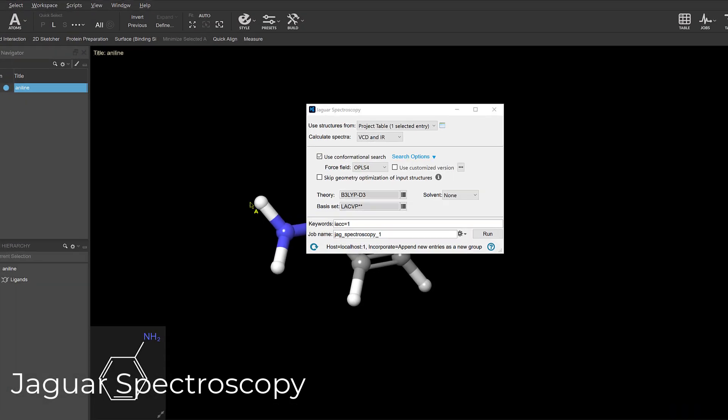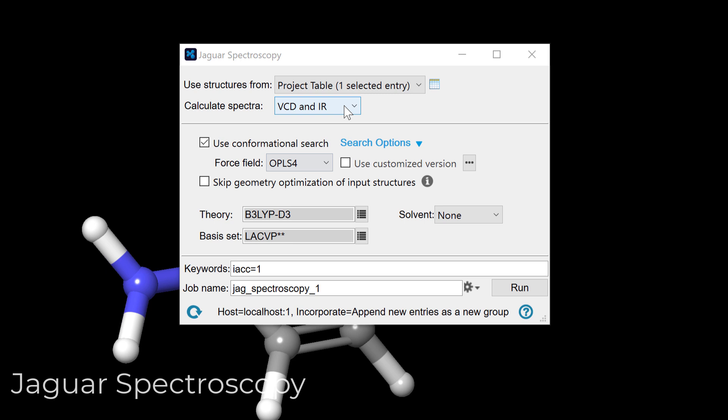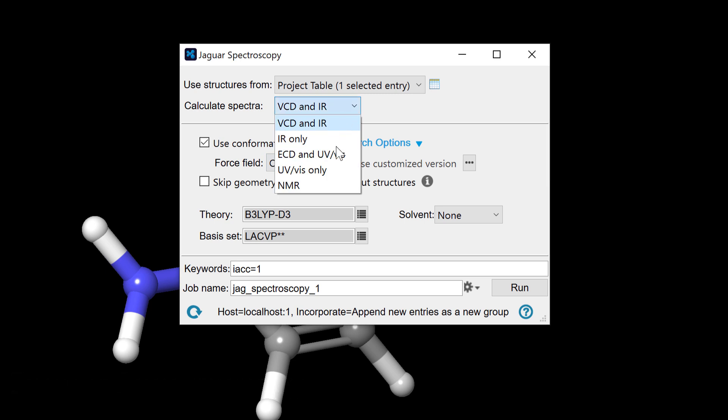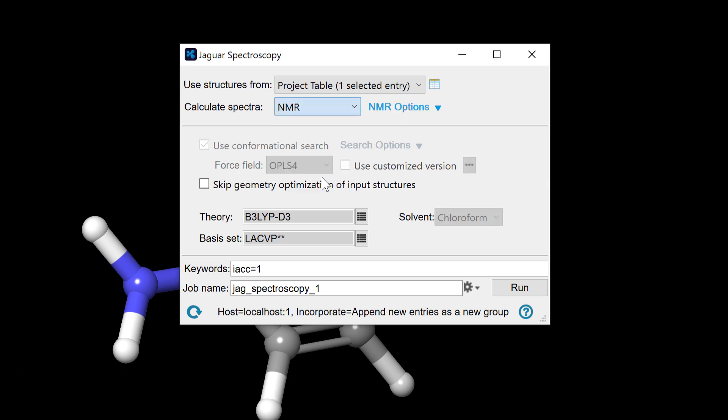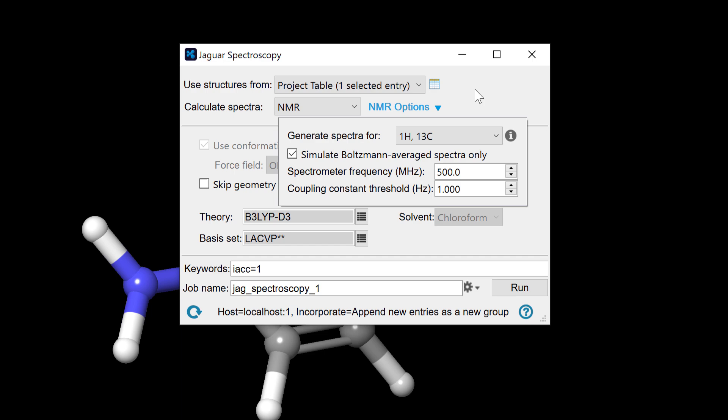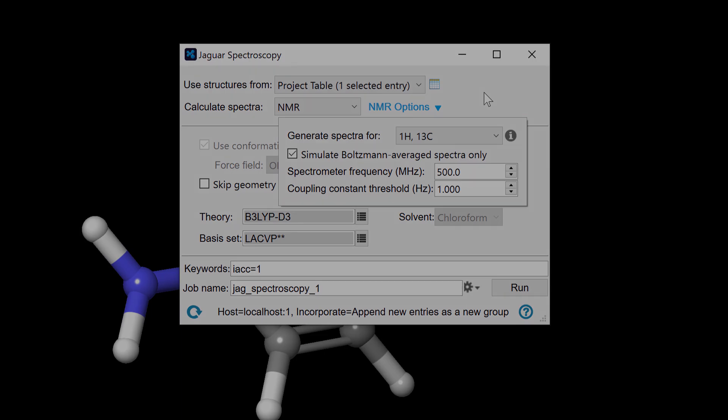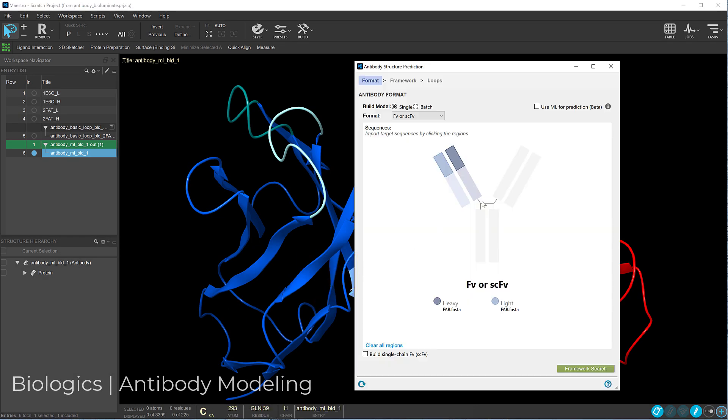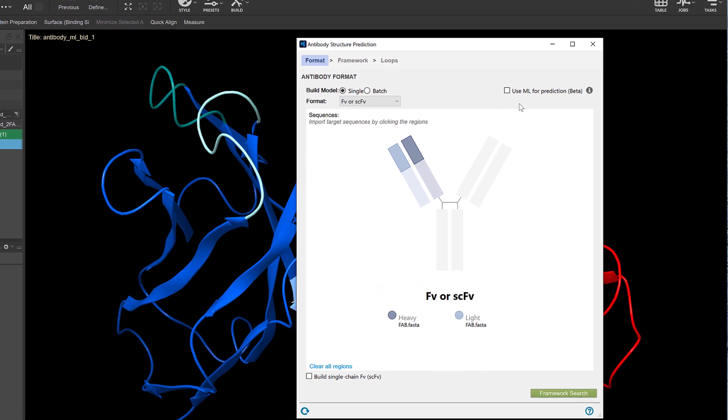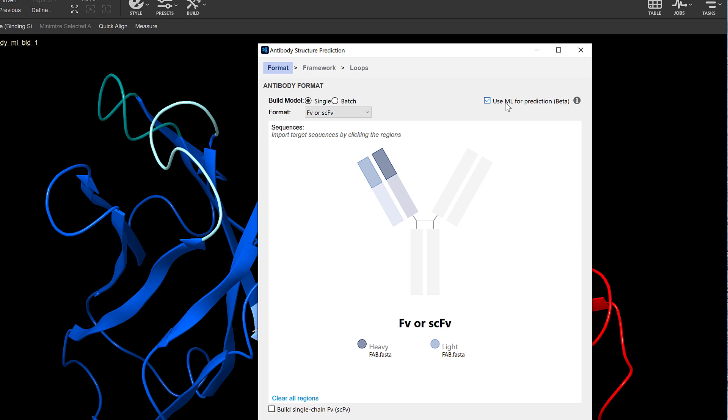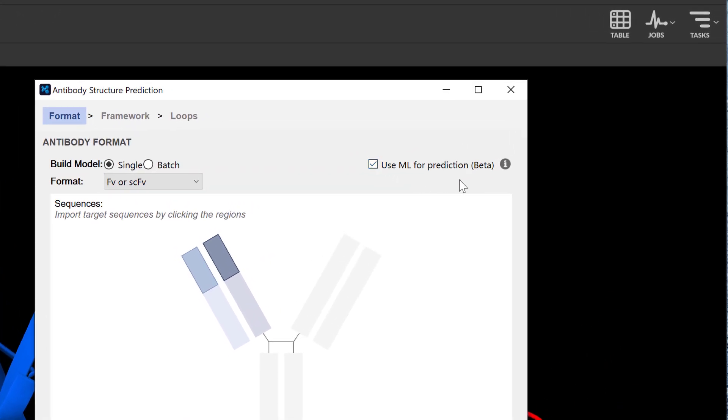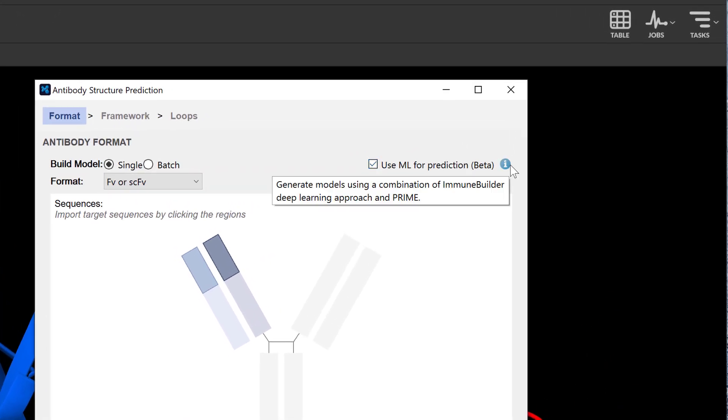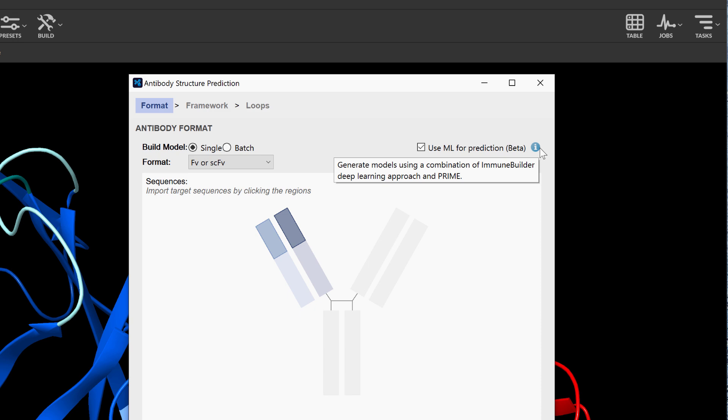In Jaguar Spectroscopy, we see improved NMR spectra predictions by identifying magnetically inequivalent nuclei, and over in Biologics, one can now perform high-throughput antibody prediction using machine learning, suitable for batch modeling of thousands of structures.